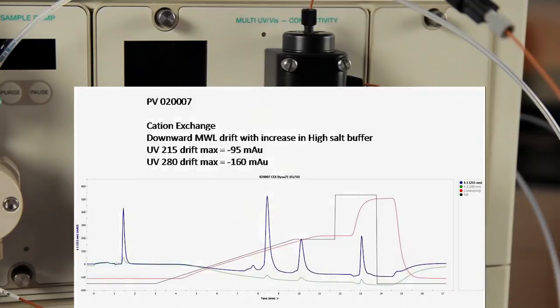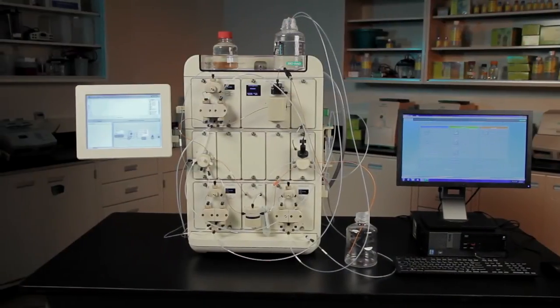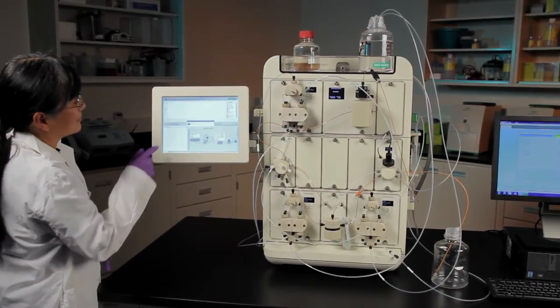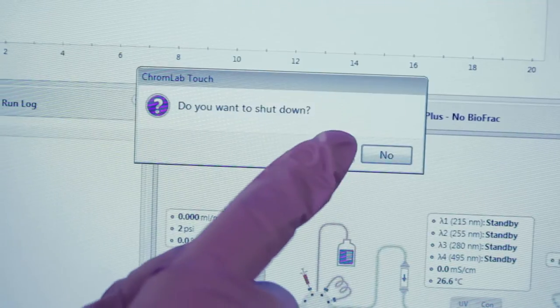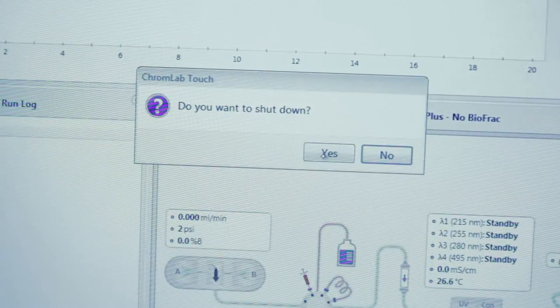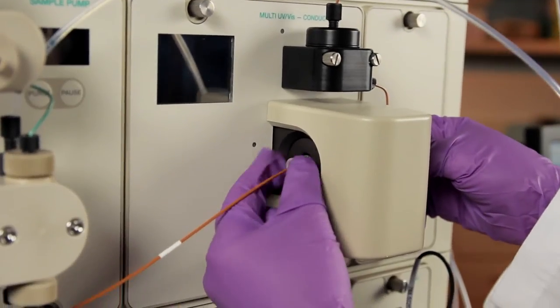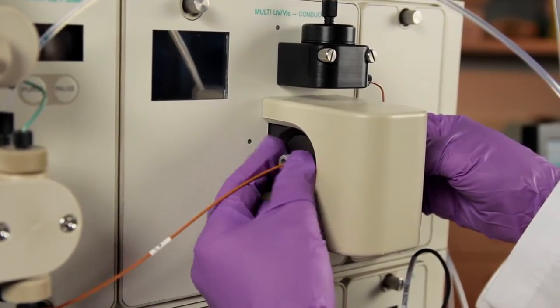To clean and remove bubbles from either a single wavelength or multi-wavelength UV detector, follow these steps. On the touch screen, select Shut Down on the drop-down menu to exit Chrome Lab and shut down the NGC instrument. Disconnect the inlet and outlet tubing from the UV cell.